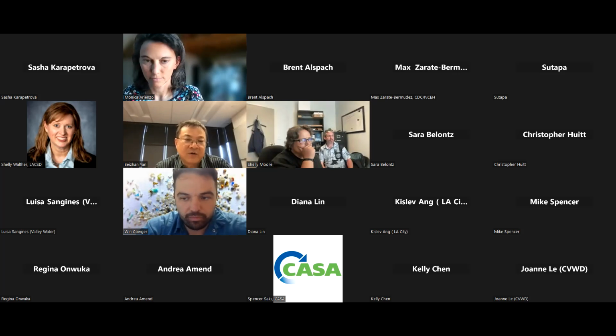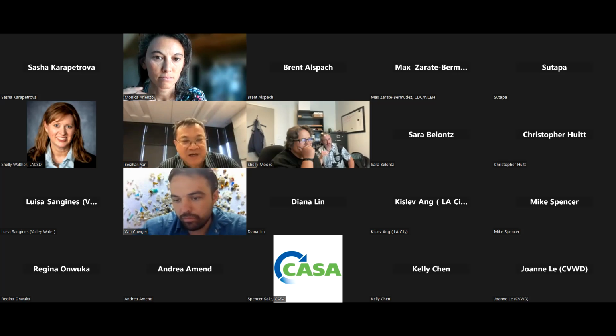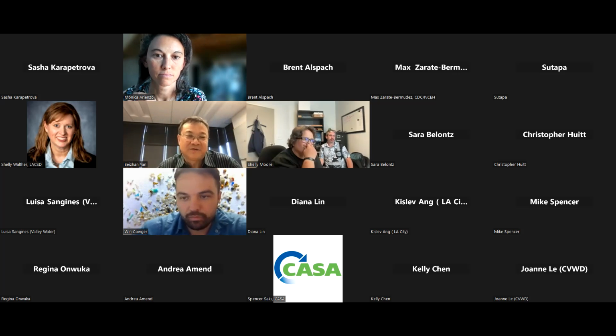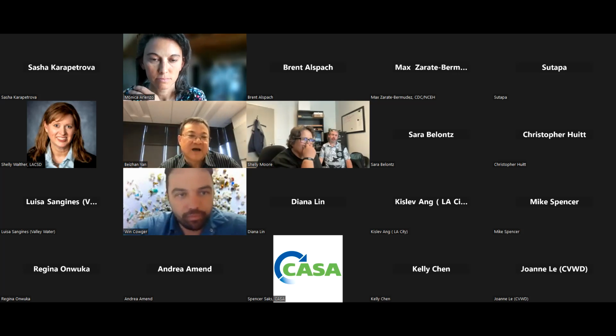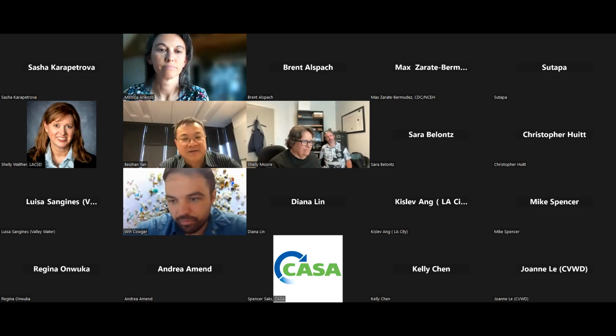So our current method is to try to remove it. Of course, this is my hope, my dream, that Columbia can get some donors that can potentially help me set up a plastic-free lab, so that I can remove the particles, remove the plastic from the air, from the water, from our lab environment. That can really answer your question, Wynn, on how we can minimize this background.